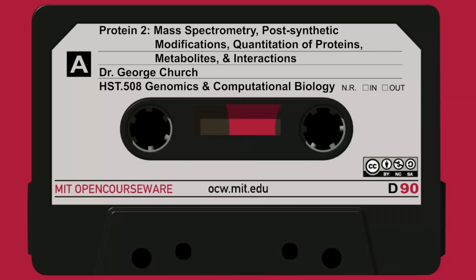micelle. And so this observation, of the potent ability of this detergent to denature proteins and then to resolve based on mass, with the small exceptions of very hydrophobic proteins or very carbohydrate-rich proteins, most other proteins will have a very nice calibratable relationship. Similarly, the charge on a protein approaches zero as the pH gets to the point where it's titrating out all the titratable groups, and this can be calculated, and the resolution of this is about 1 part in 100 or better.